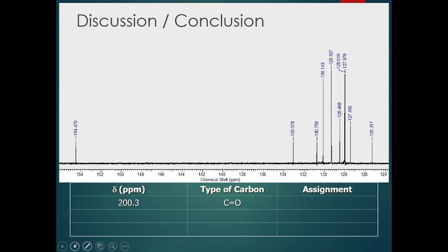But we would like to be able to get a bit more information for our interpretation, make the NMR a bit more useful. And to do that, we can look at some of the other characteristics. There is one that should jump out at you, something my daughter would have noticed when she was 8. So don't overthink it. She was not an NMR genius at age 8. That is peak height. You'll notice we have several fairly short peaks, a couple of intermediate height peaks, and then 4 tall peaks. So there are 2 factors that affect peak height.